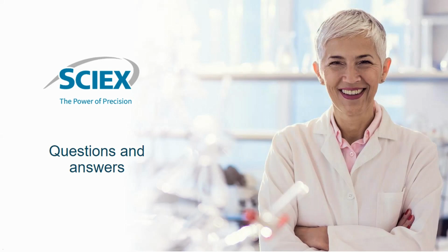Great, thank you, Philip. Now it looks like we have time for about one more question here, so we'll go ahead and wrap up after this one. This question asks, how are CIEF PI calculations done for BioPhase?